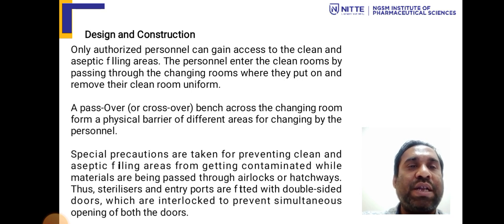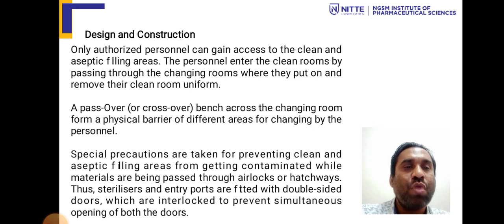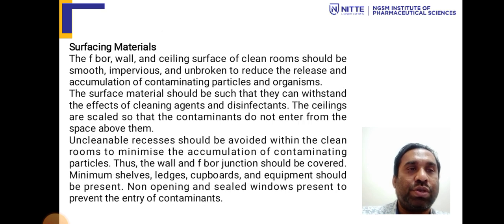Special precautions are taken to prevent the clean and aseptic filling area from getting contaminated while materials are being passed through the airlocks or hatchways. Thus, sterilizers and entry ports are fitted with double-sided doors which are interlocked to prevent simultaneous opening of both the doors.